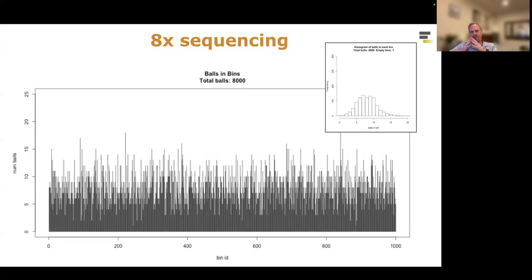So you would expect, within two standard deviations, that your genome will be between, say, 80 and 120x coverage if you've targeted 100x coverage on average. So that Poisson distribution underlies all the analysis that you're going to do about how much coverage to generate and how we should think about what that coverage spread is going to look like.